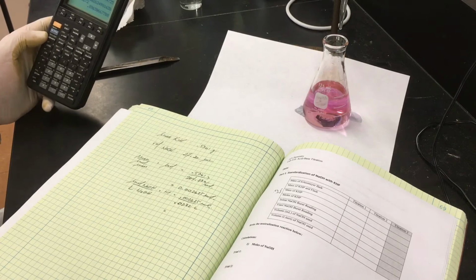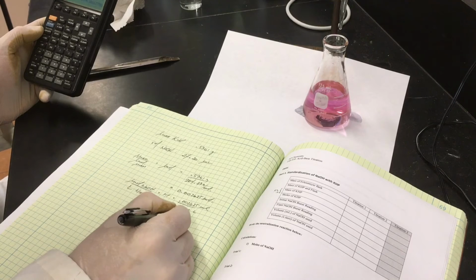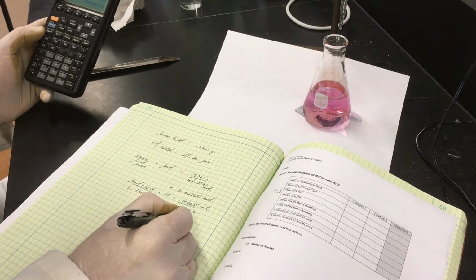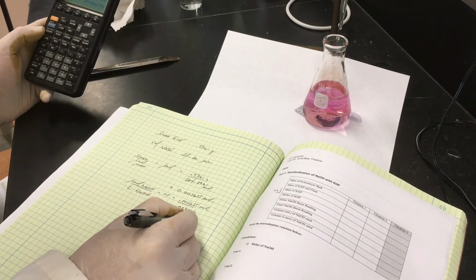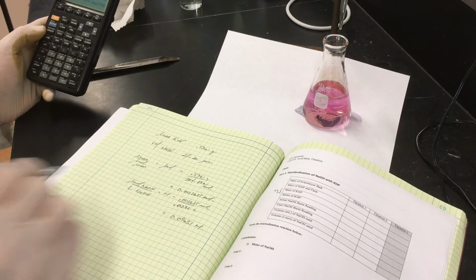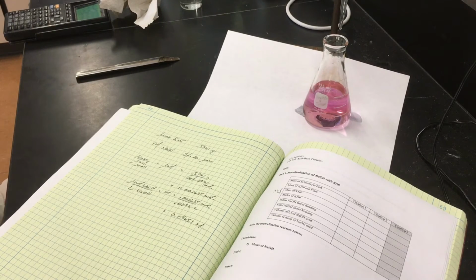So we're at 0.0965 molar. And we expected it to be 0.1, so we're pretty close.